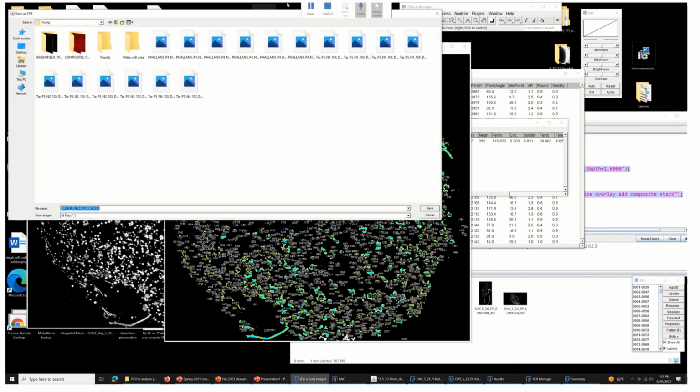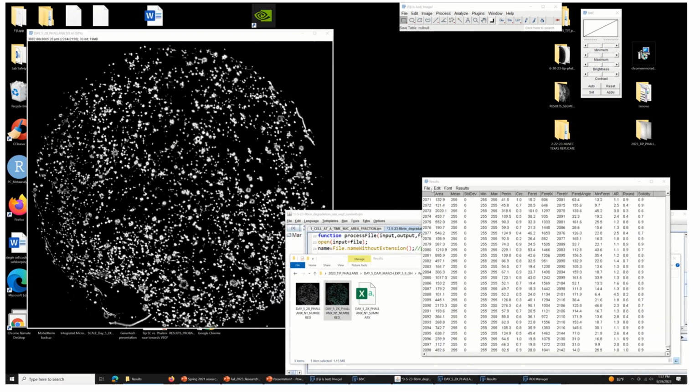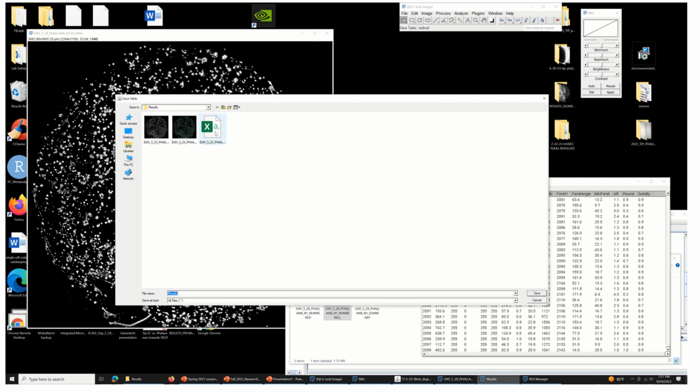Okay, now I'm going to save the results, so save as, and I'm just going to save it with the same name, but instead of summary, I'm going to label it results.